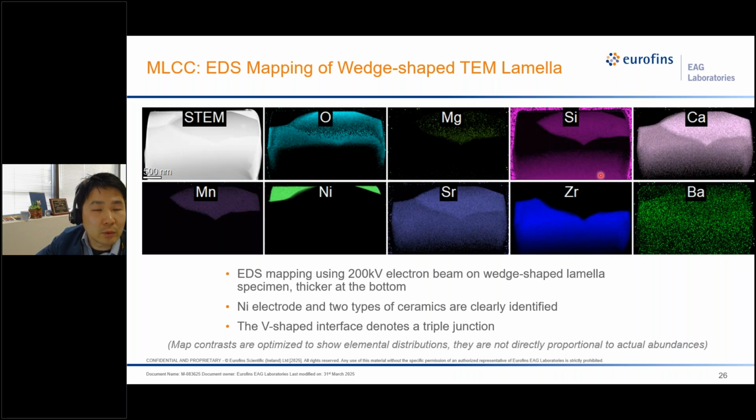So we want to target a very specific region in this sample at the interface. So we can see there's the V-shaped interface that will inform us we have the interface between the primary phase to the secondary phase, and very likely at the end of the V, there's the grain boundary, like we can image from the shape. So this is the feature embedded in the specimen that would be hard for the traditional sample preparation to target.